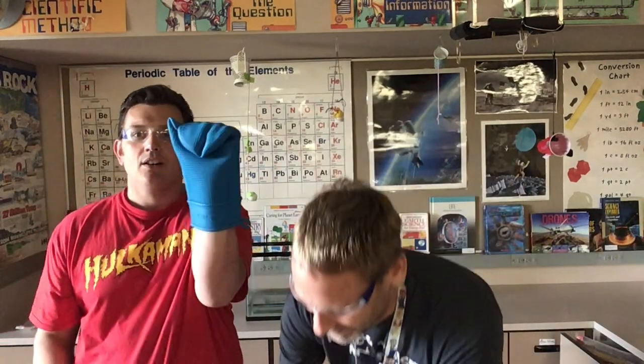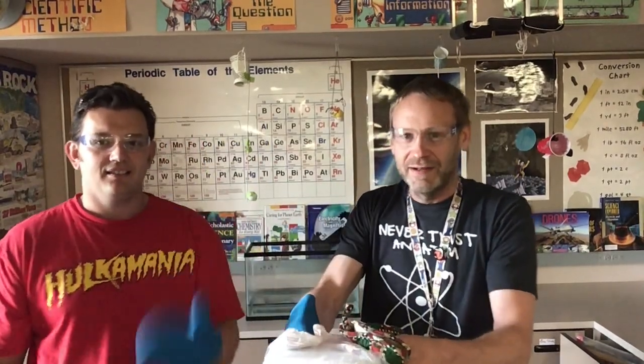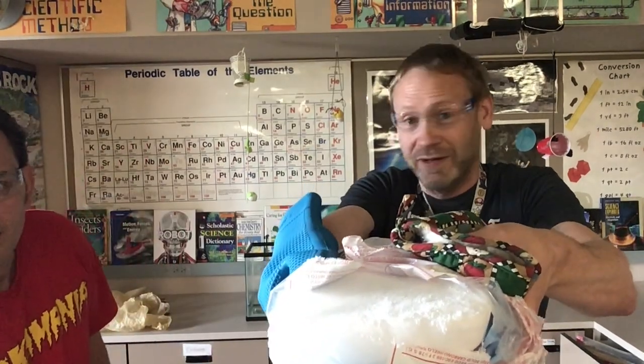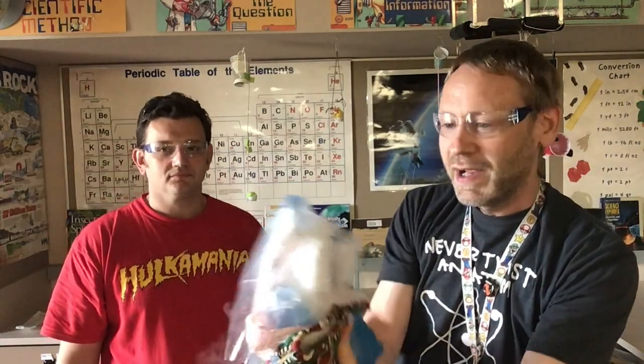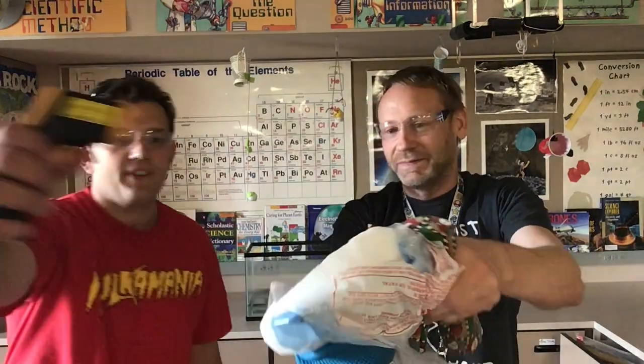What is dry ice? We've got some dry ice here. We can hopefully hold this up and show you. Gotta have mittens on — yep, mittens, goggles, you got it. Oh, this is a chunk of dry ice, pretty big piece too. This is carbon dioxide solid. Okay, this is about — well, what temperature do we get? Let's find out.